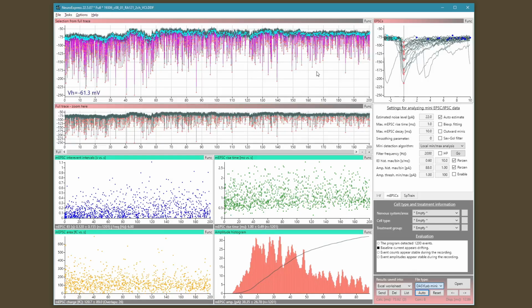On the other hand, it has to be reliable and stable, and definitely I would like to maximize the quality of the analysis. So to do that, I hope that potential users will send me feedback or questions so I can further improve this program.